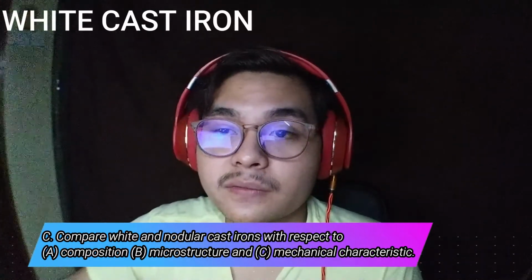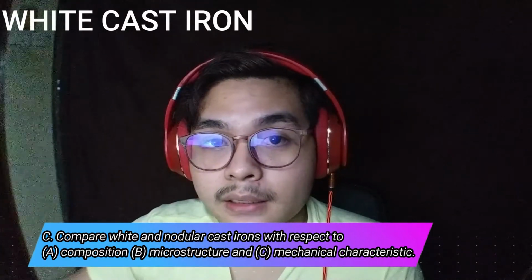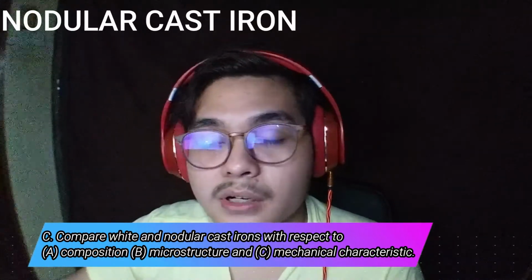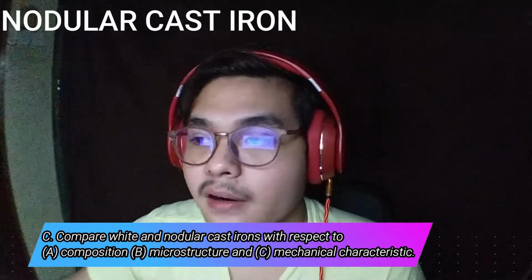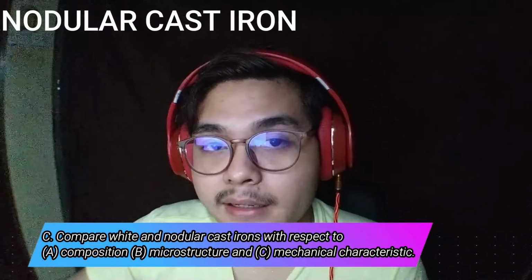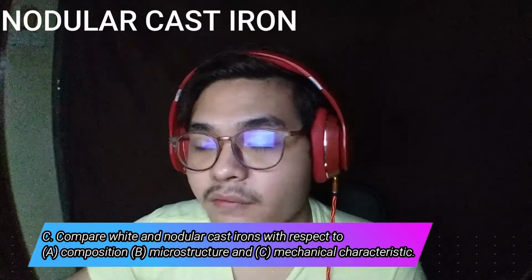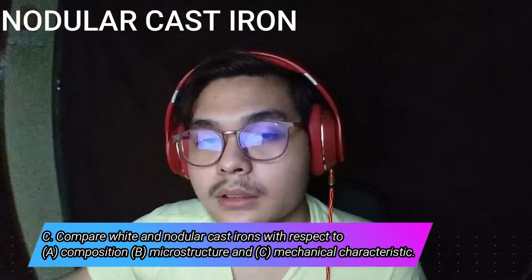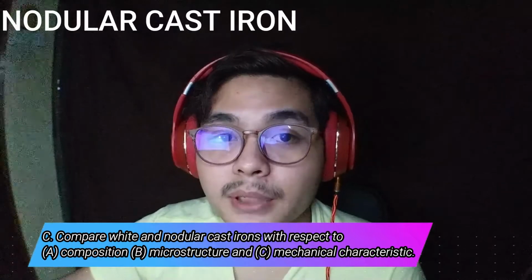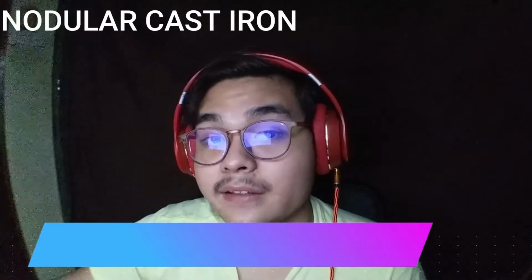And lastly, fracture surface. Next is nodular cast iron. The composition for nodular cast iron is that magnesium or cerium is added to the gray cast iron composition before casting occurs. This is to prevent the graphite flakes from developing during slow cooling of the iron. And then the microstructure is a spherical graphite structure in a pearlite or ferritic matrix, or nodular. The mechanical characteristics are high ductility, elastic modulus, mechanical strength, corrosion resistance, and it's low cost and easy to use.